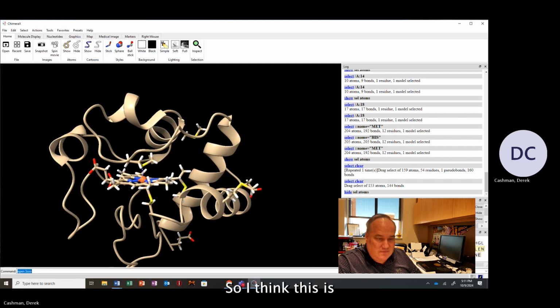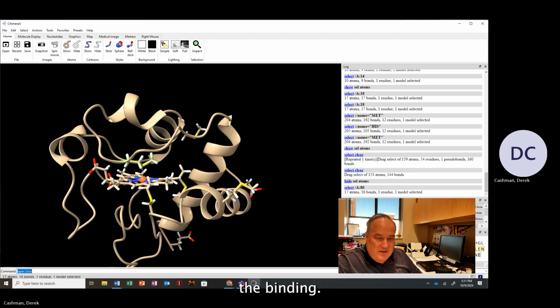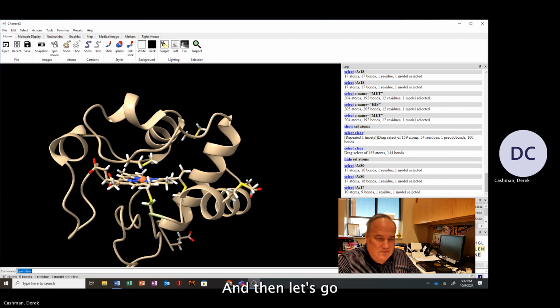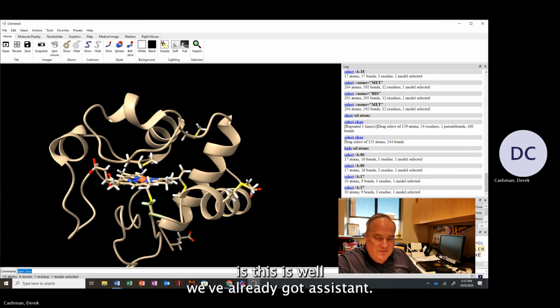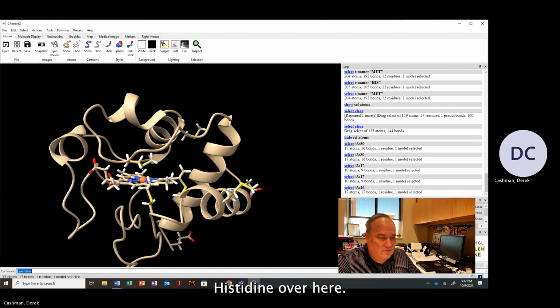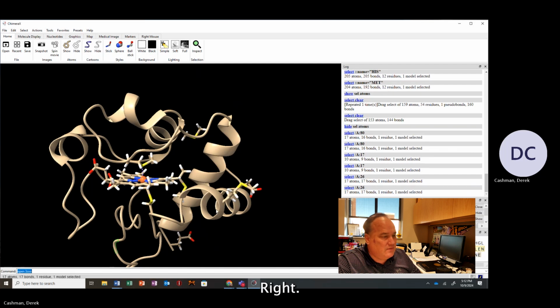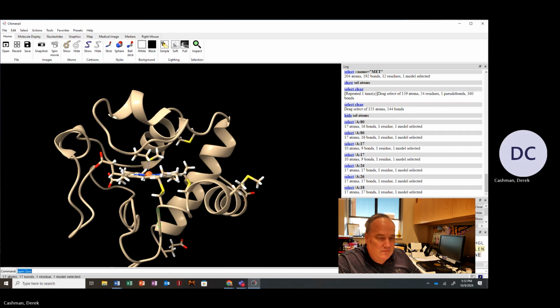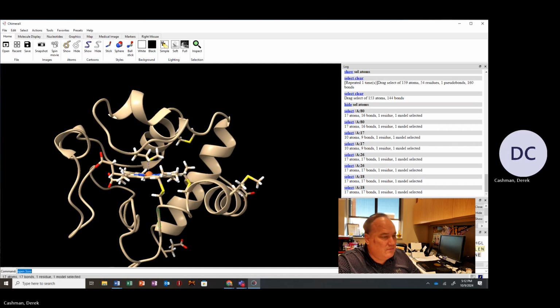So I think this is, there's methionine, and then there's our, well, we've already got the cysteines. Where's our histidine? Histidine over here, right? There's our other histidine. There we go. There it is.